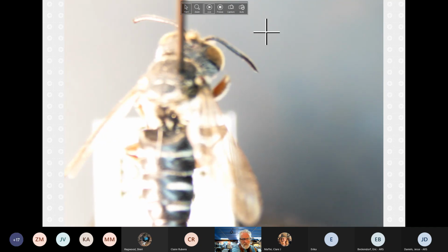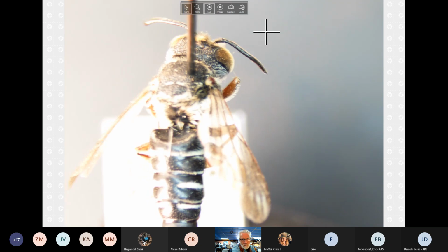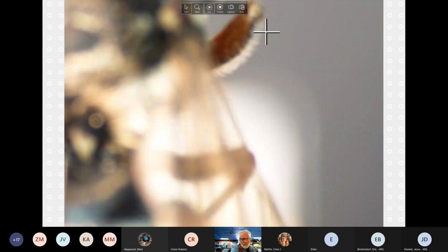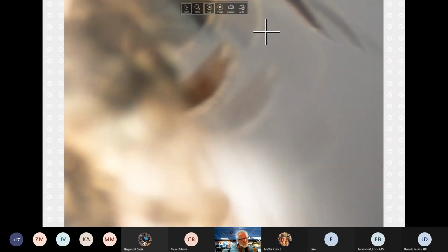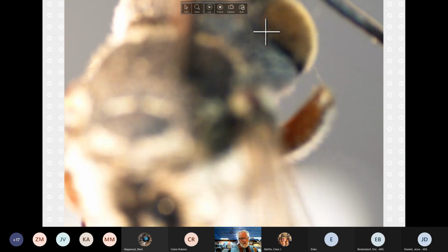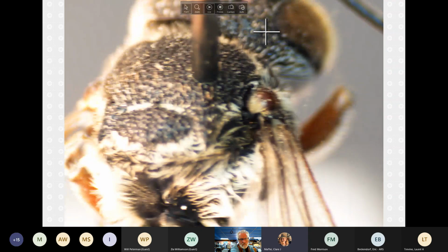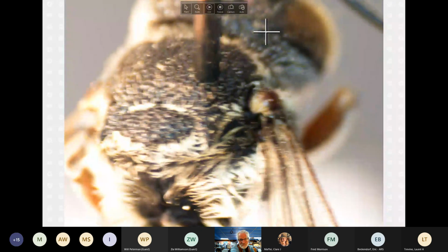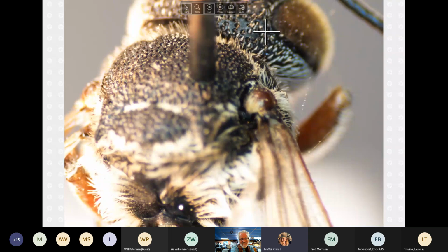Okay. I feel like we're spending the whole time just focusing this microscope. I almost said damn microscope, but I didn't. But then you did, so does it count? No. Great. This is a good rule.